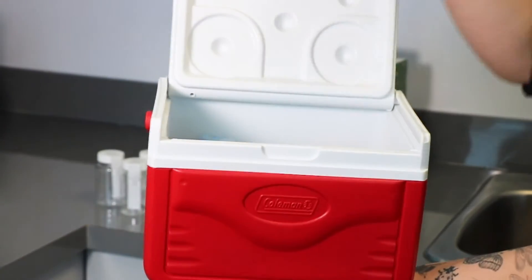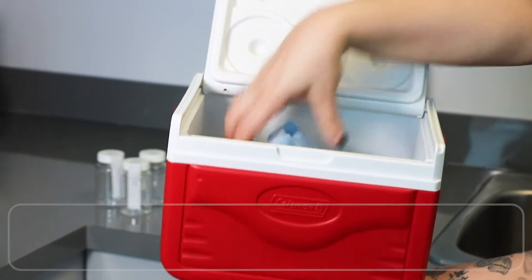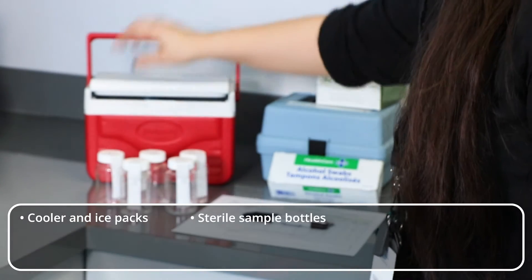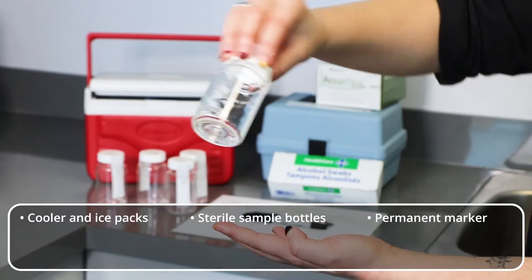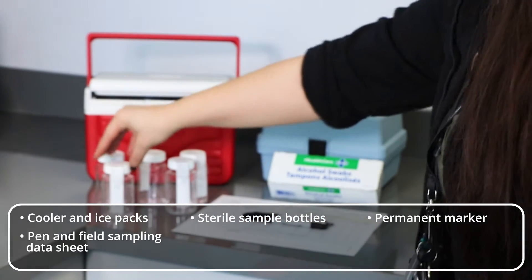Before leaving to take your samples, be sure to prepare your sampling kit. Your kit should include a cooler with ice packs to store samples, approved sterile sample bottles containing sodium thiosulfate, a permanent marker for labelling, and a pen and field sampling data sheet to record the details of samples taken.